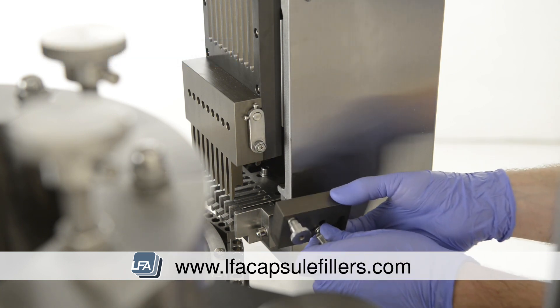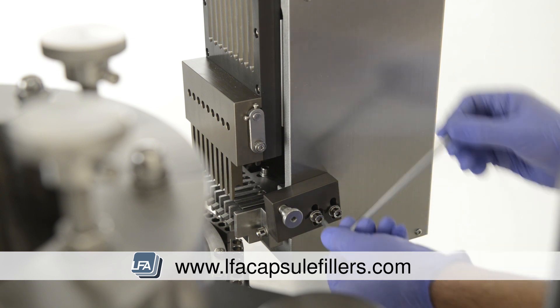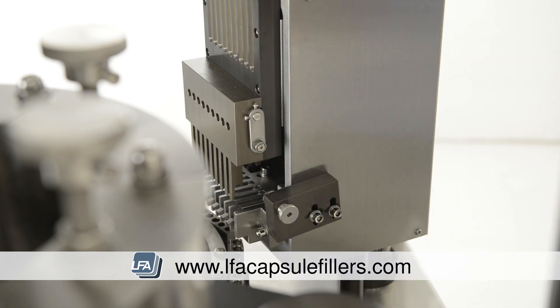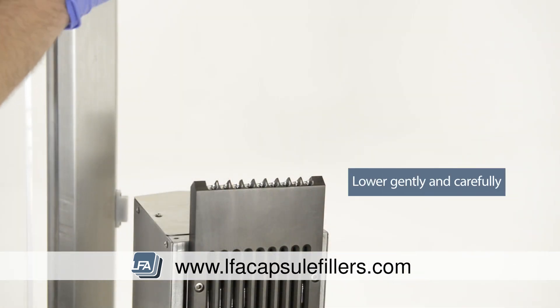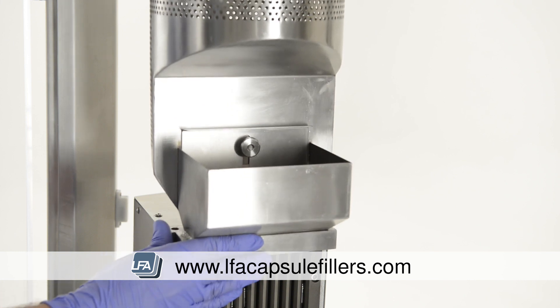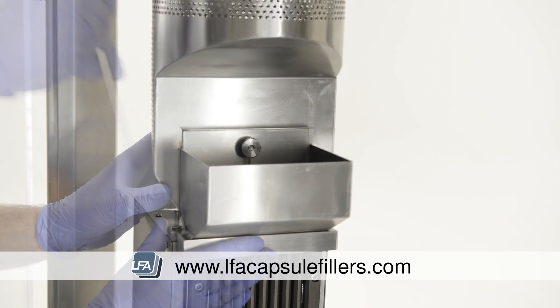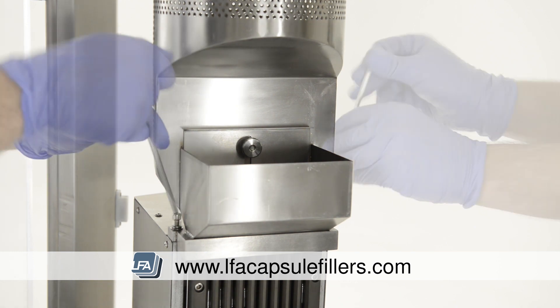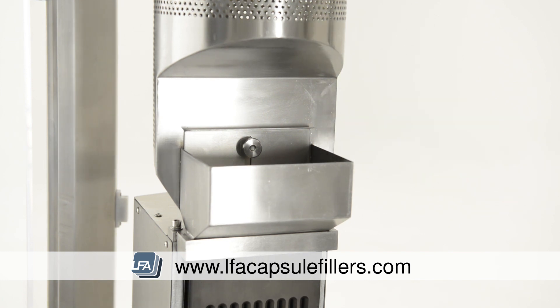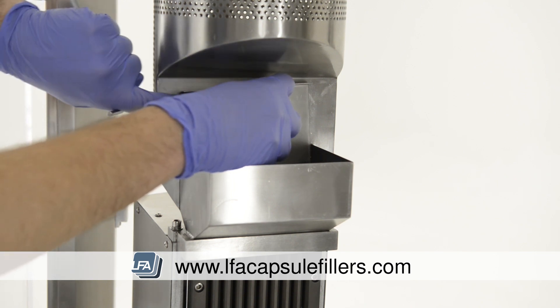Manually turn the FACF by hand to ensure the capsule sewer is at its highest point. Now reinstall the capsule release pin using the guidelines you marked on it earlier — simply line up the lines with your bolts and tighten equally. Once tightened, press your capsule release pin in. When replacing your hopper, be very careful not to damage the front section. Gently lower it over the top, ensuring it's central and not rubbing at either side. Replace the two bolts at either side and tighten evenly. Test again by turning the manual handle and look and listen for any rubbing or squeaking. Finally, open the door of your hopper to allow capsules to flow through the machine again.